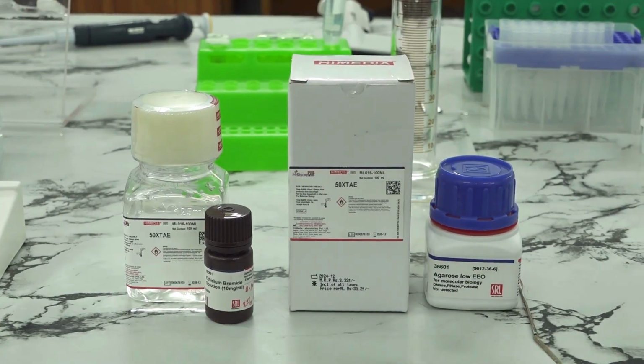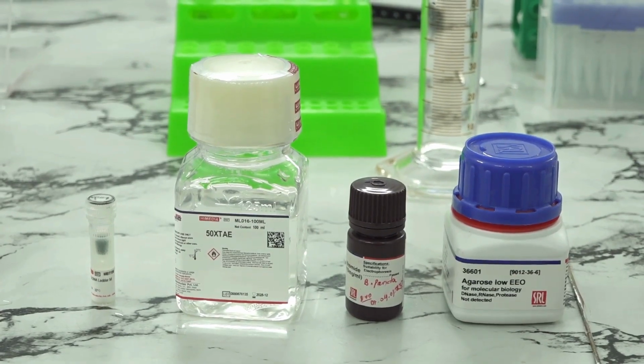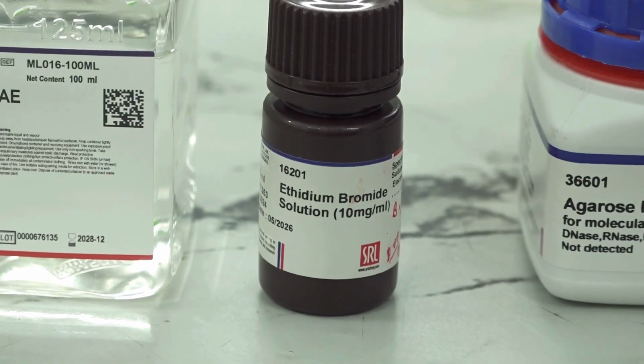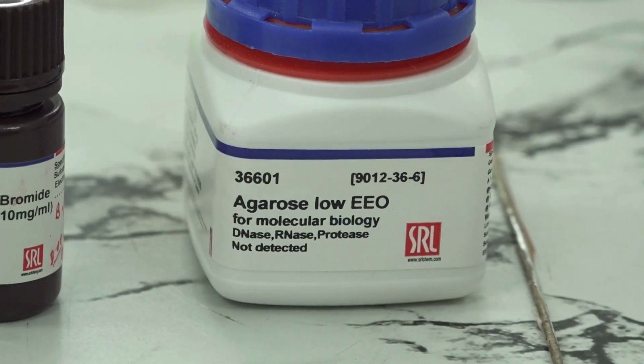Gel electrophoresis. Reagents: TAE, Tris, acetic acid and EDTA. Ethidium bromide. Agarose.